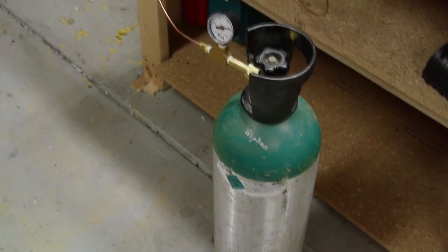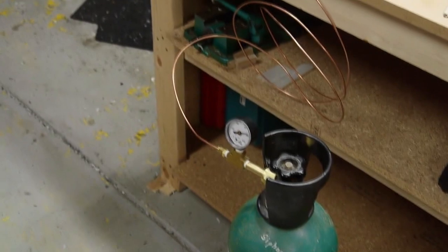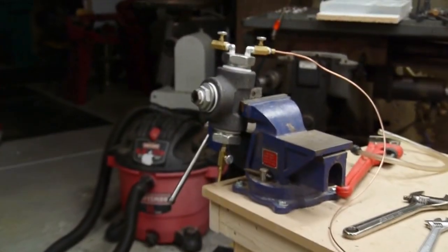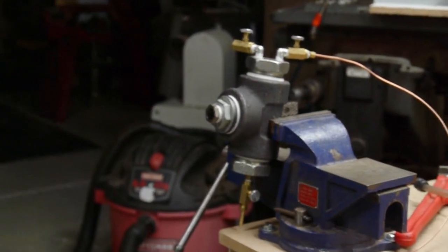There's no regulator—that's just a T with a gauge on it. The liquid CO2 flows through that copper tube and into the chamber there.